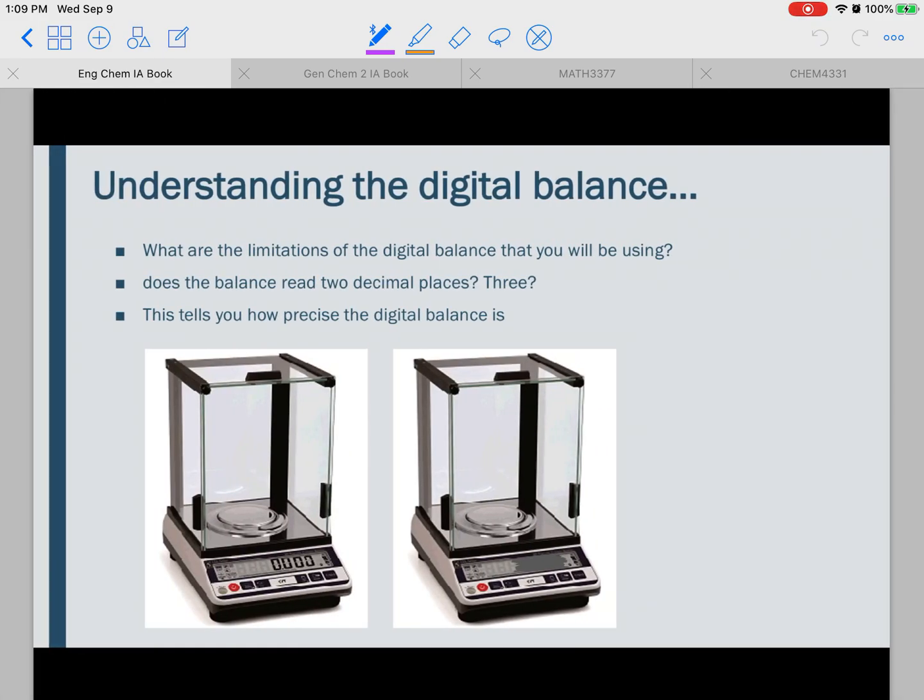So another thing we're going to be using is a digital balance or scale. When using a scale, we have to understand that some scales are going to be more accurate than others, so we need to understand the limitations that our scales are going to have. Some scales might read three decimal places, some might read four, and so you just need to know what it is that you're dealing with.